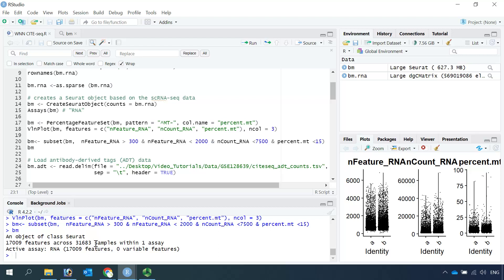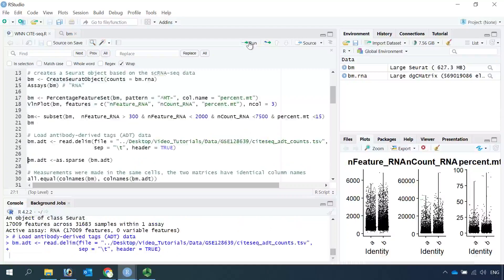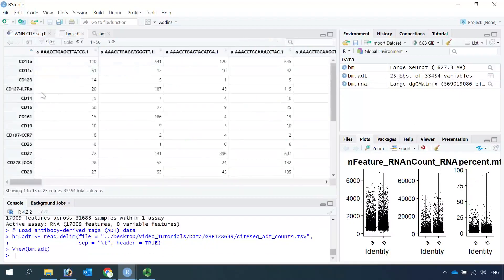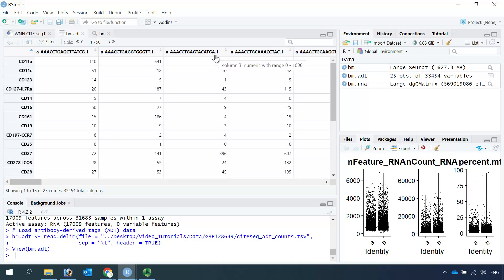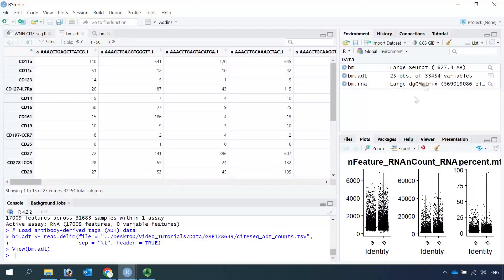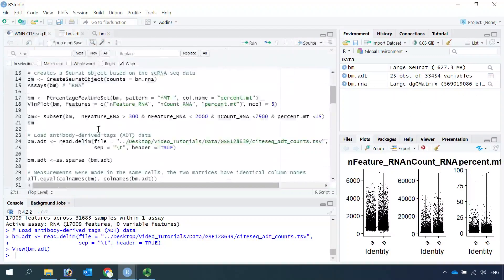Next we can load the ADT data. If we click the data, you can see the row names are the antibody names and the column names are the cells. We have the same number of cells as the RNA assay before quality control — 33,454 cells. Because we performed quality control, the RNA dataset now only has 31,683 cells, so we need to subset the ADT data to match.